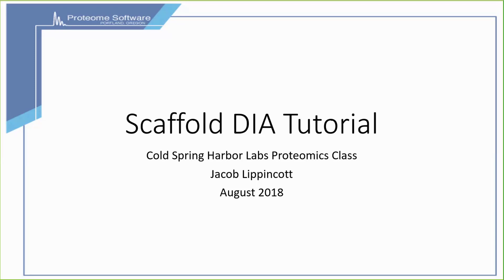Now that Brian's talked about the background and the technology behind DIA, I'm going to talk a little bit about how to use Scaffold DIA for the analysis of DIA data.